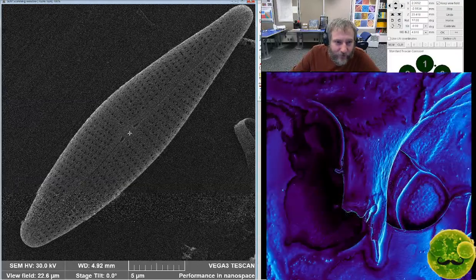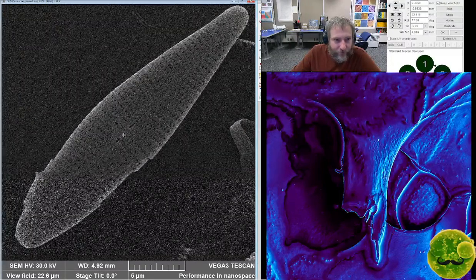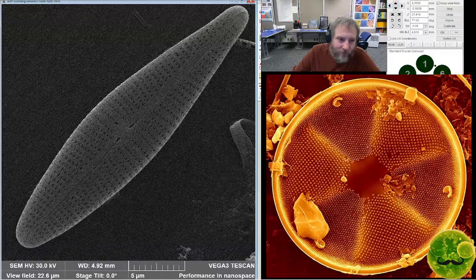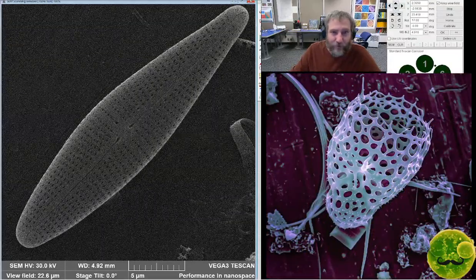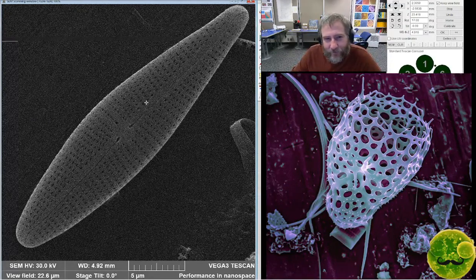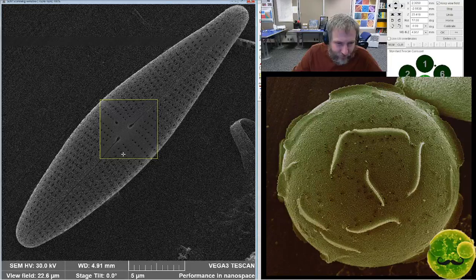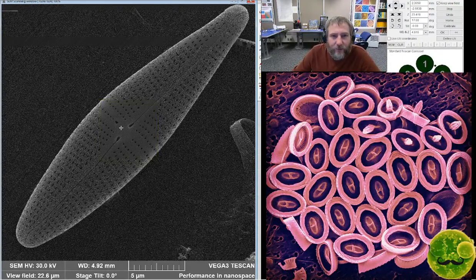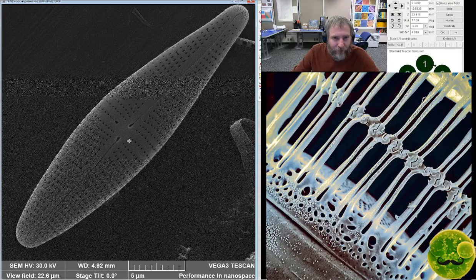And you can see that this diatom, which is why I thought initially it was an Afrocymbella, I'm having a hard time getting it right where I want it, also is a little bit asymmetric in the apical axis direction. Like this side is slightly more humped and this side is slightly flatter. And this is the ventral side and that's the dorsal side. And that's the normal behavior for Afrocymbella. And some gomphonema are a little asymmetric, but it's less common that you can tell, obviously like this. And this one's a little bit more asymmetric than most, which is another clue that it may not be gomphonema ultimately, but it also may not be Afrocymbella, so.